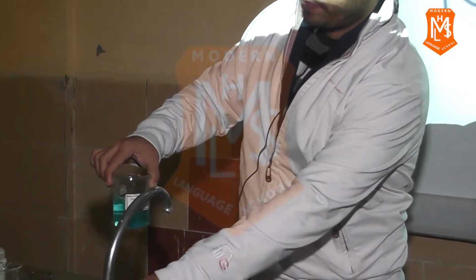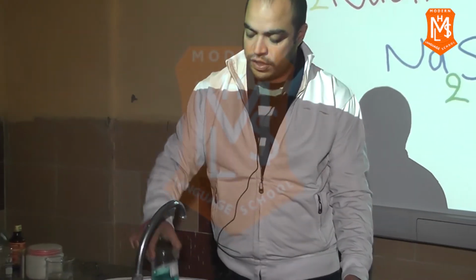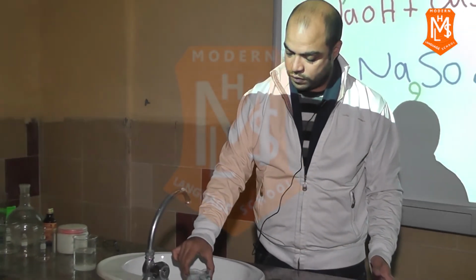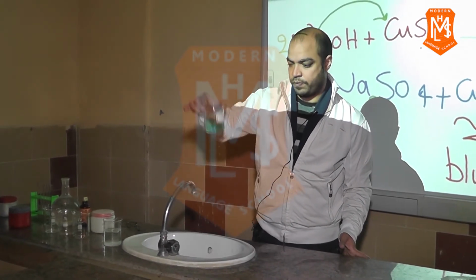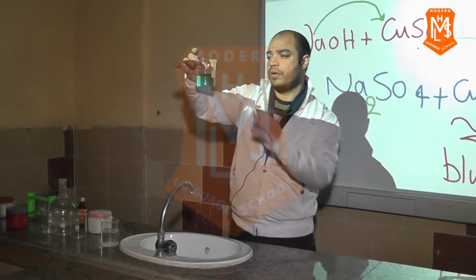As we see, copper sulfate dissolves in water.